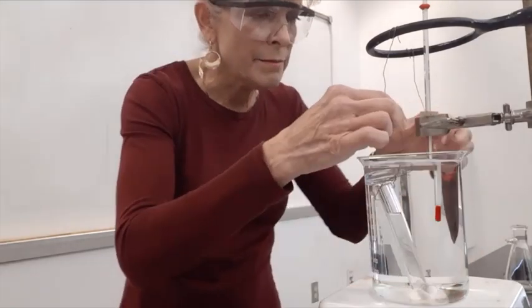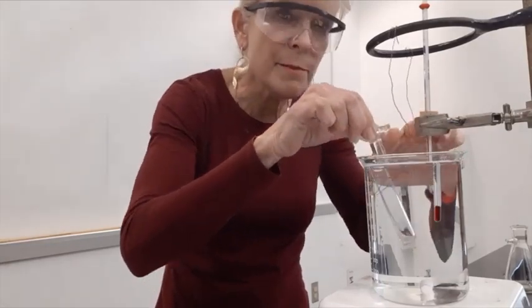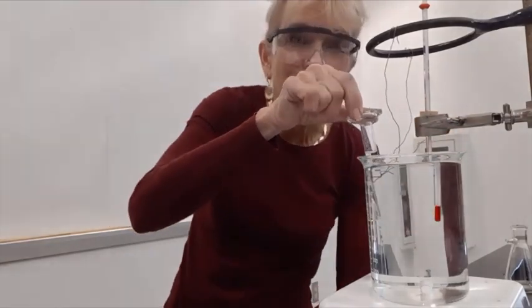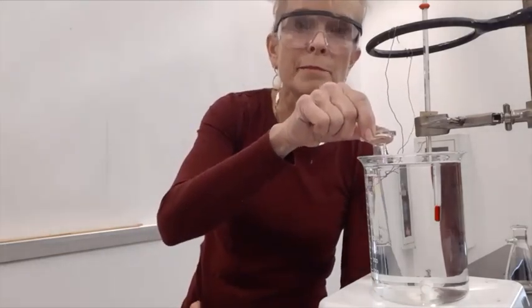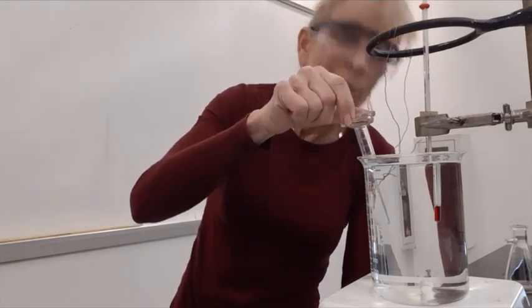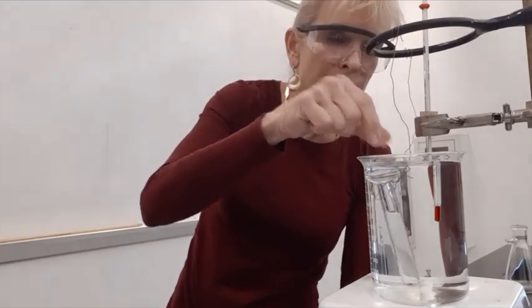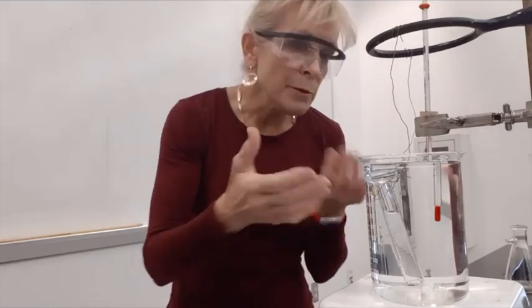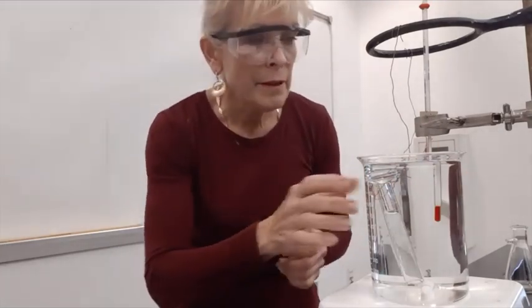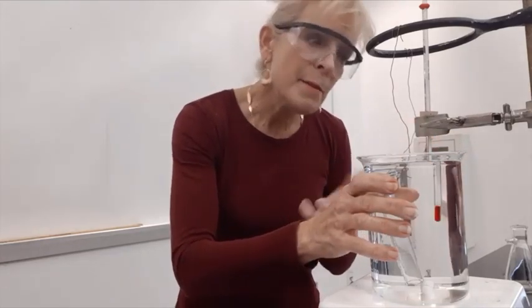A great big beaker full of water, and a thermometer, of course, back here. But here we have something rather interesting. We've got a small 10 ml graduated cylinder with about a 4 milliliter bubble of air, and that is suspended by some wires in this beaker. So at room temperature, the air and water vapor bubble is about 4 milliliters.